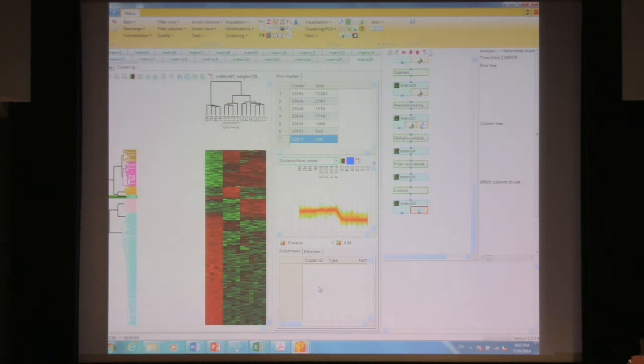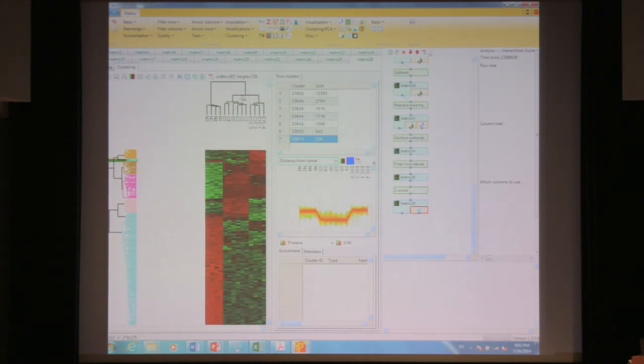So, I think that's all we've got time for. But you guys can explore. One more thing I meant to show you is if you hold Control and click on the red, you flip the node. That can be helpful, especially up here where you've got treatment groups and say I want the control to be first, then you can flip them around like that.